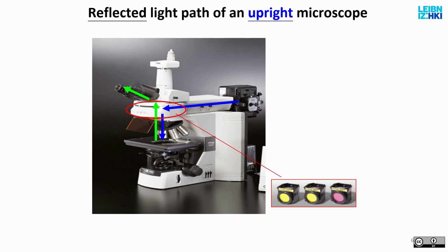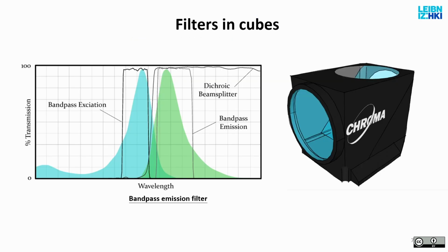So if you work in microscopy, you will see this. They pop in quite easily, so you can change the configuration of your microscope if you have an unusual color in your sample. So this is not an obstacle. Keep in mind that if the microscope per se doesn't have the color that you exactly need, then you can buy such a cube for about €1,000 and then replace the existing one.